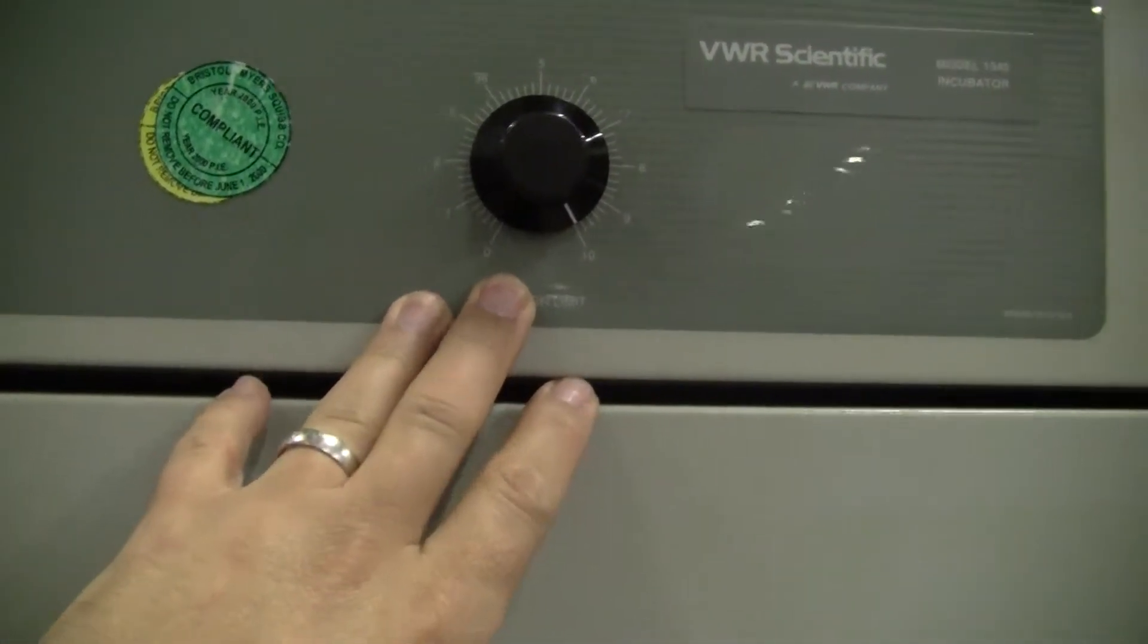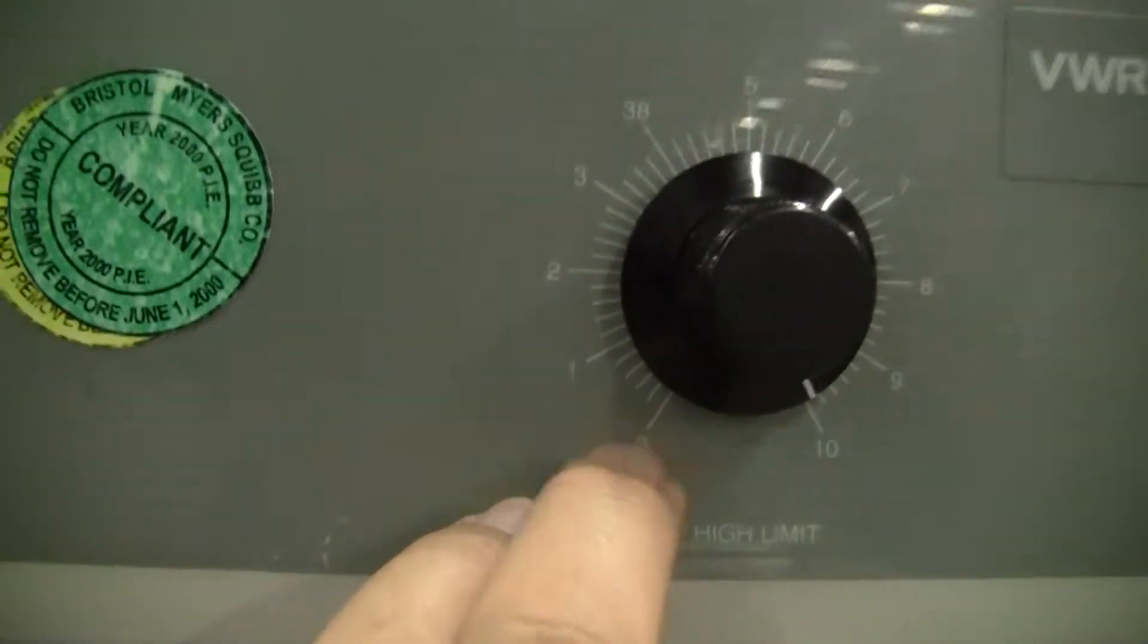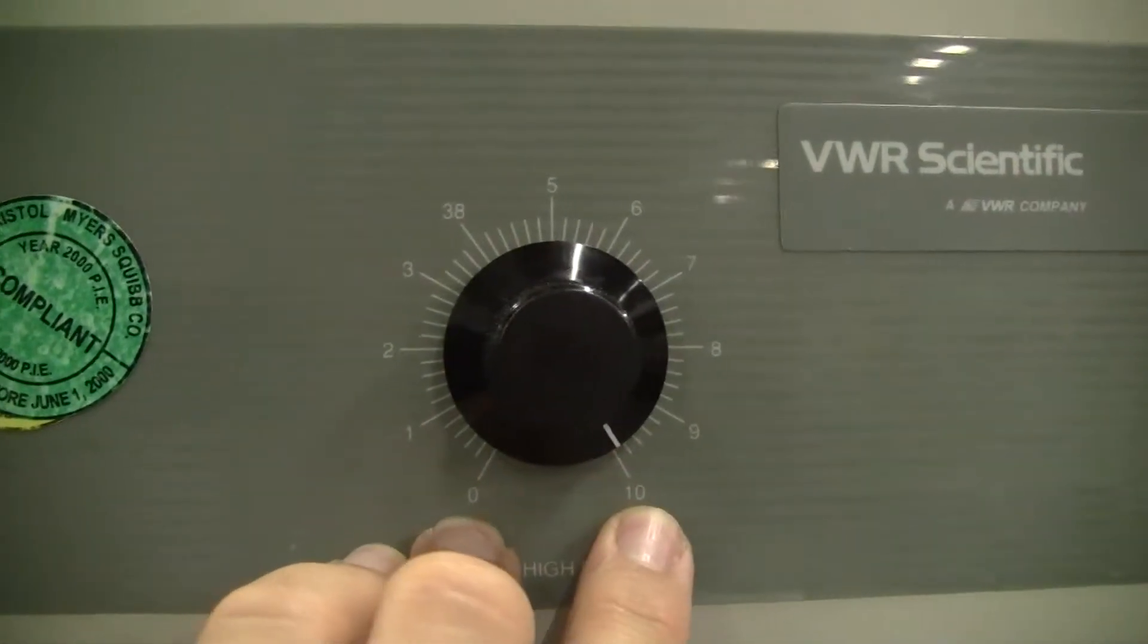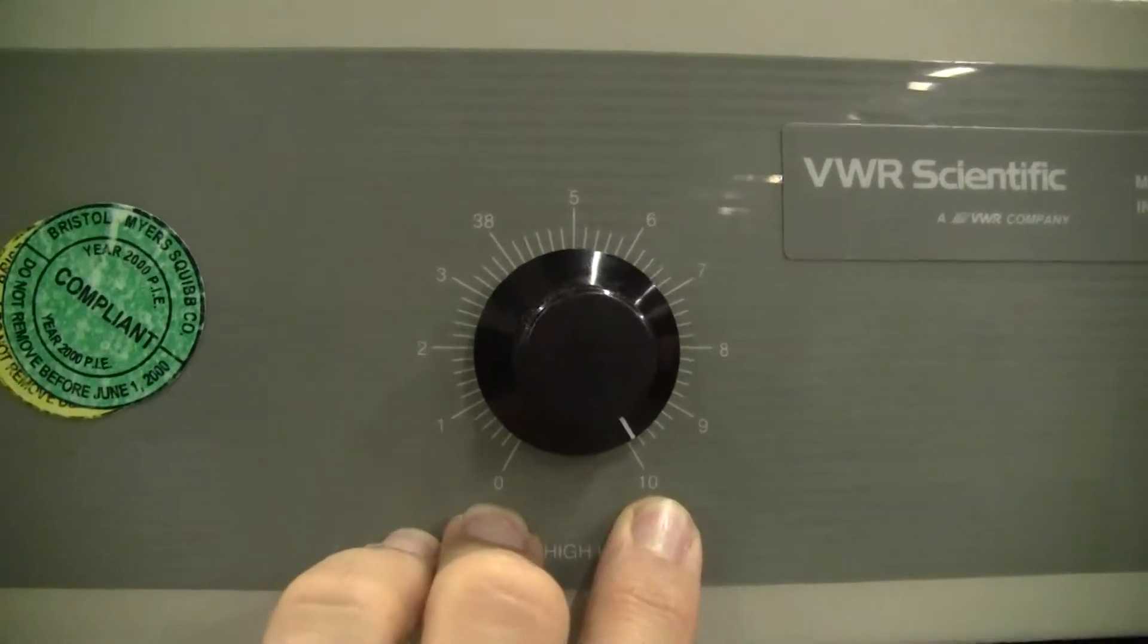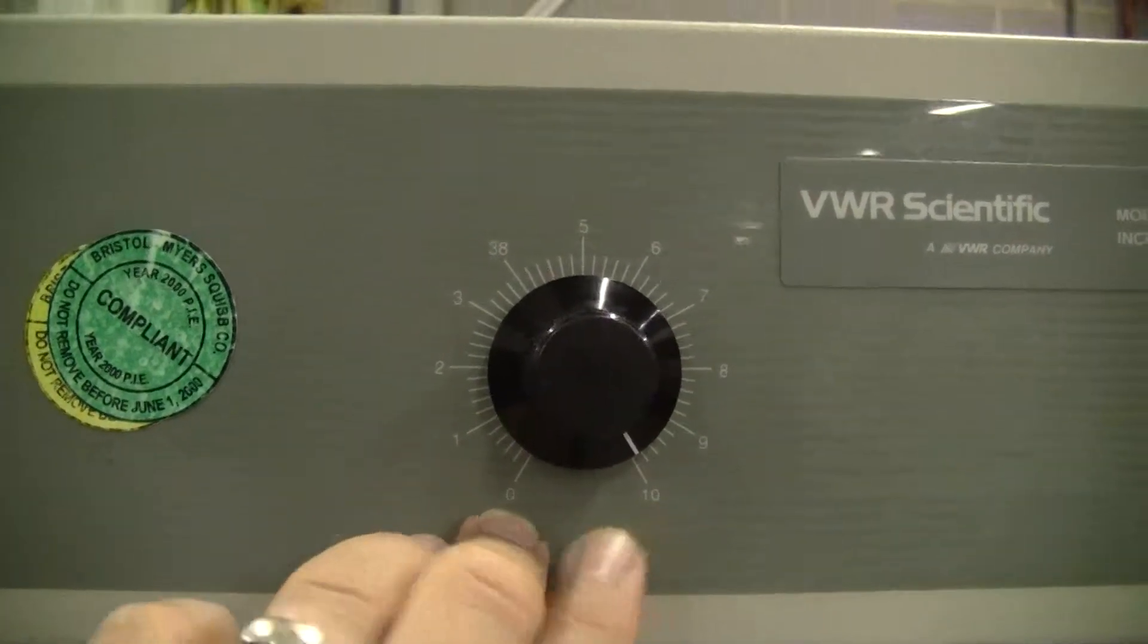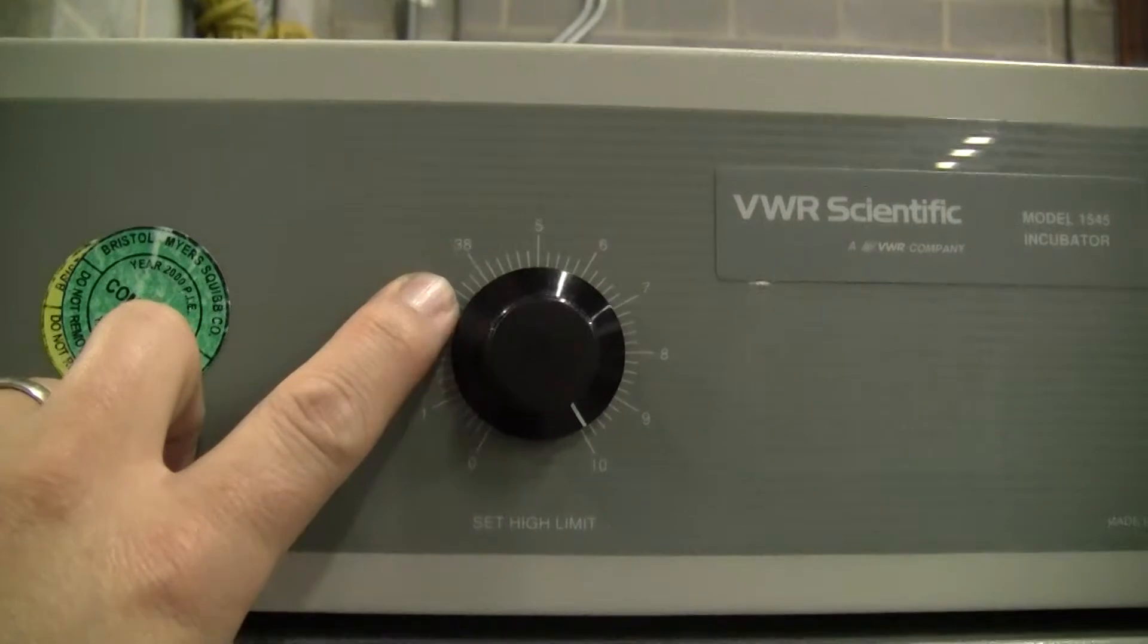A key note on the over temp is that the dial goes from 0 to 10. It's a percentage controller. It does not indicate any kind of temperature. Ignore the 38, it's meaningless.